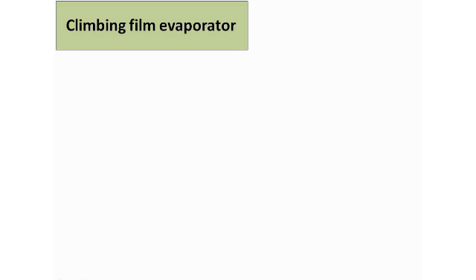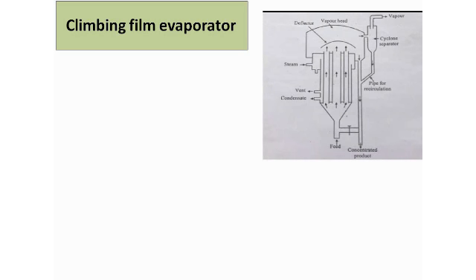See, the name itself tells you. Climbing film means the film of the solvent which is about to get heated will climb, right? So this is the overall design of the equipment. Here we are going to discuss the different parts, but let us first discuss the principle.